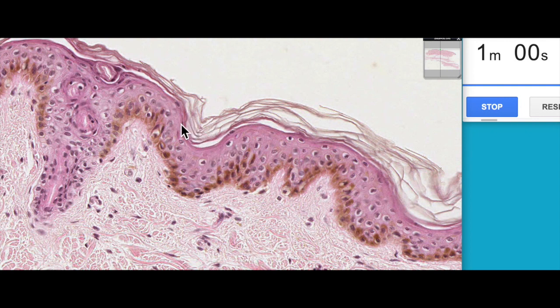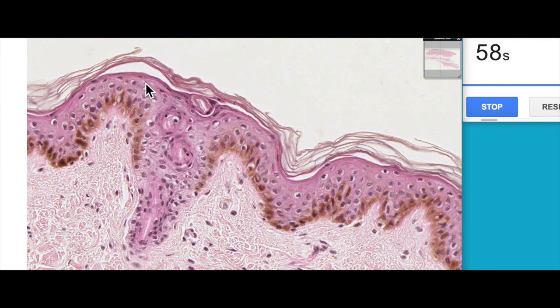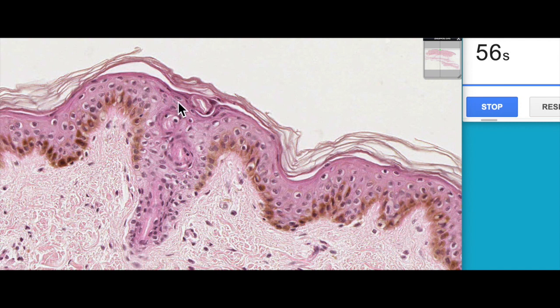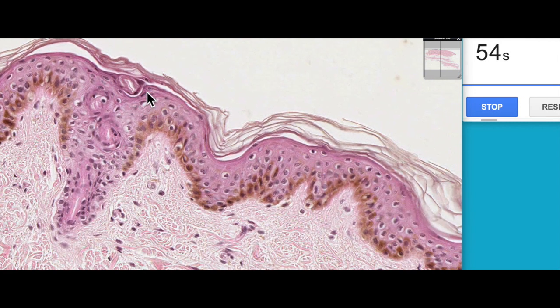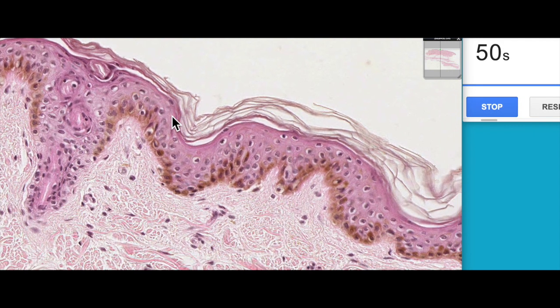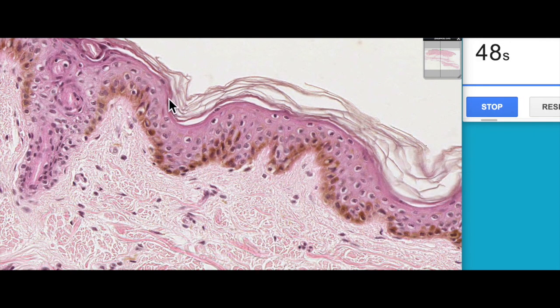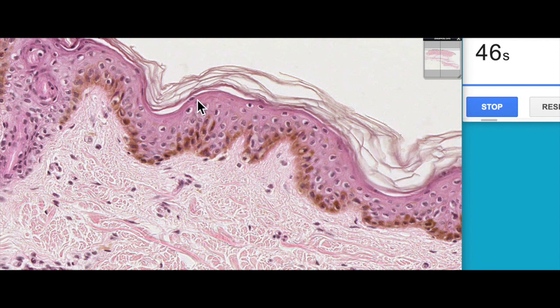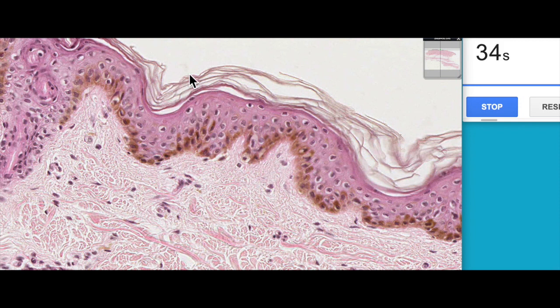Then we have our stratum granulosum. It doesn't look as granular as the other section we saw, but certainly the cells accumulate their keratohyalin granules here. They release a lamellar substance — a glycophospholipid — which helps to waterproof the skin in this region, and when they undergo cell death that waterproofing material is released, covers the surfaces of the living keratinocytes, and helps to prevent dehydration or loss of water.